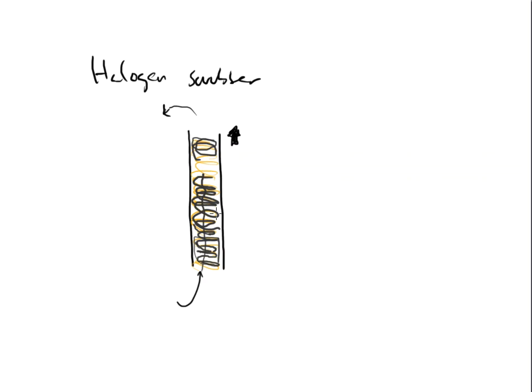Now, let's talk about why those halogens are there in the first place. Okay, we've gone through this whole discussion about how halogens are bad, halogens can't make it to the detector, halogens react with the copper, it removes them from the sample so I don't have to worry. Well, why would they be in there in the first place? That doesn't make any sense, right?